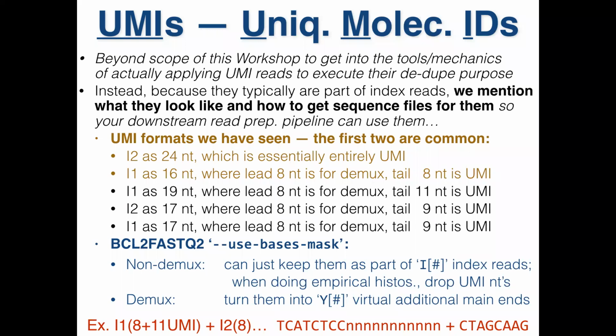You can commit an entire index read, because we like things like unique duals. Maybe that's not the best way. Maybe you should have a unique dual and then still have a UMI.